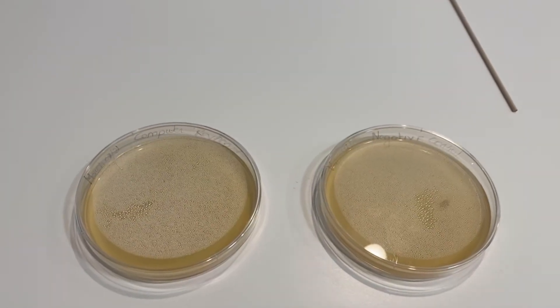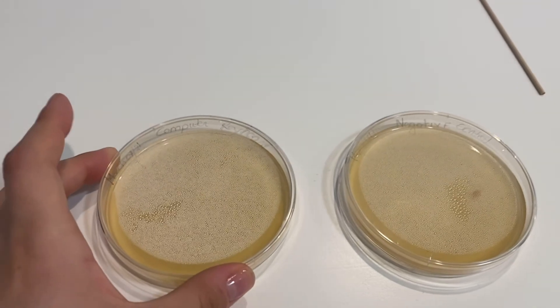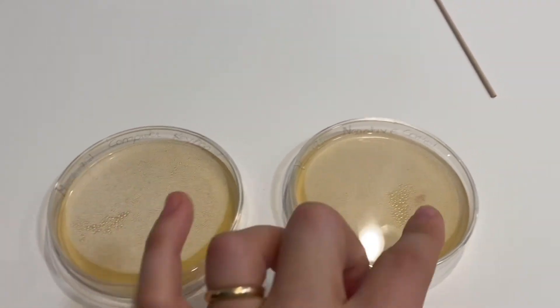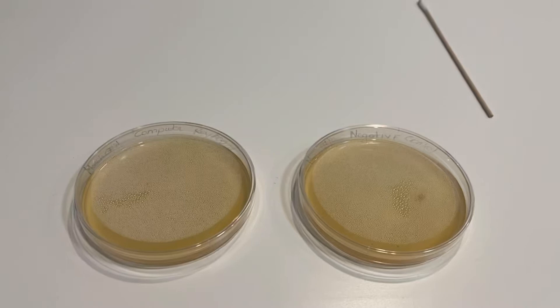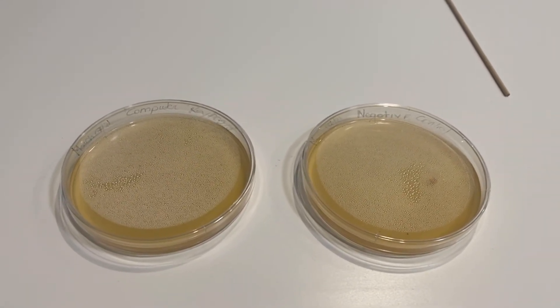The surface sampling is already done. In one plate there is a label indicating it is from the computer keyboard with the date, and then the negative control. We need the negative control to compare those two plates. And now we leave at room temperature, 3 to 5 days, and then we will see the results.